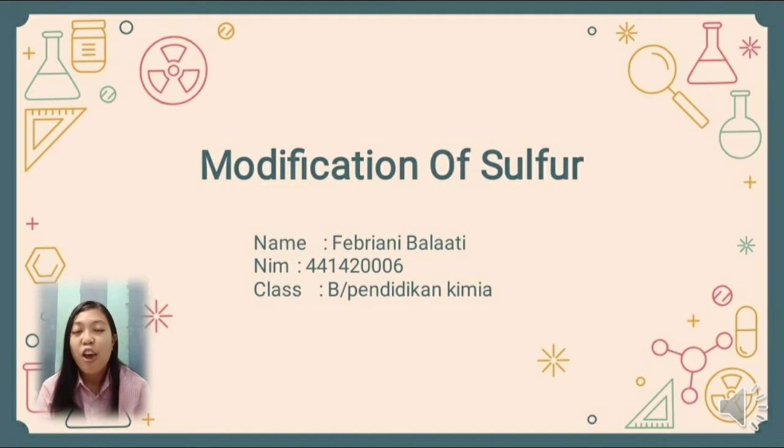My name is Febriani Balaati, NIM 441420006, from class B, Pendidikan Kimia. Okay, this time I will explain about the modification of sulfur.